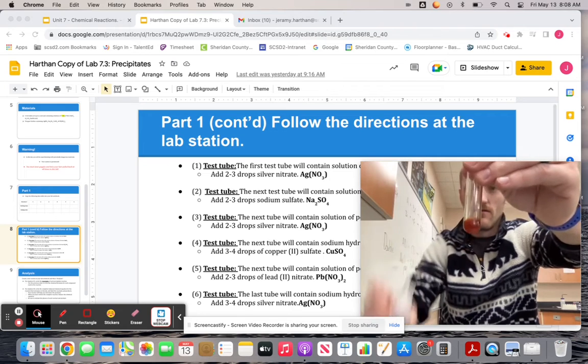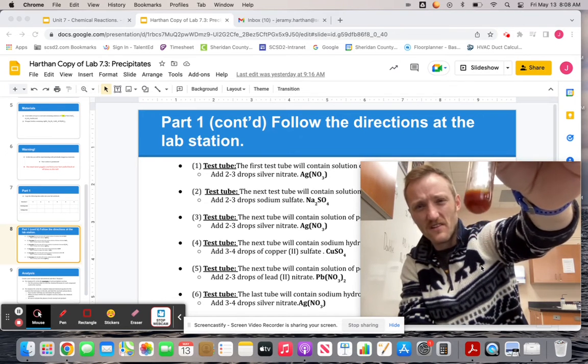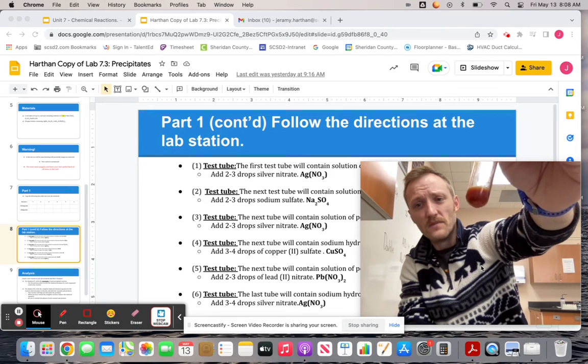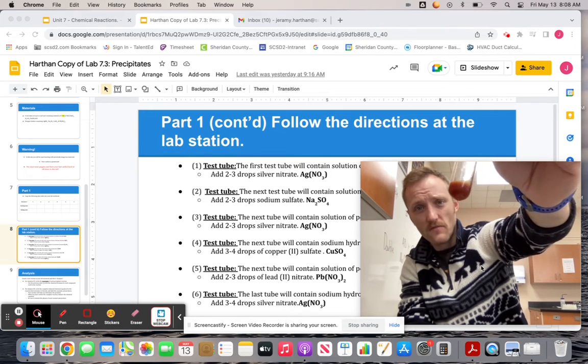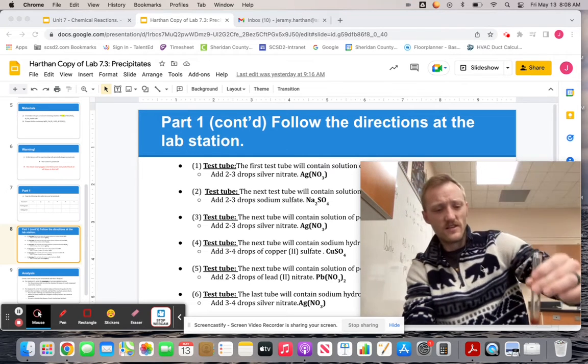Whoa, look at that. Holy moly. Right? It goes like a real tomato juice color. This one's kind of cool because as it separates and as it drops out of solution, we get a real rusty brown color deposit on the bottom if you give it time. So maybe at the very end, we'll look at that one. Okay, so very, very distinct color change there.